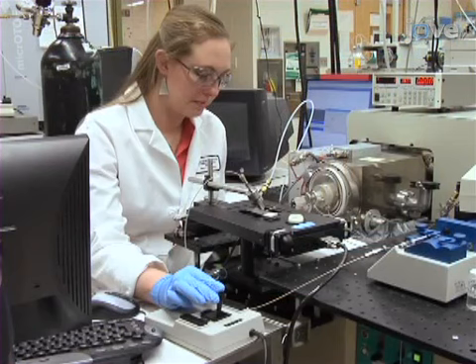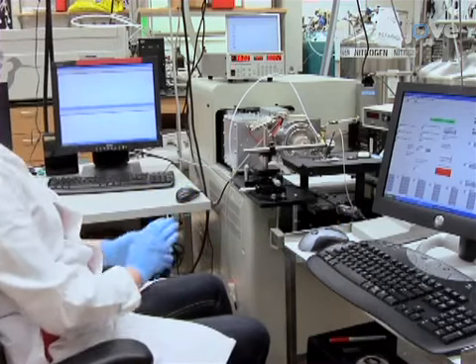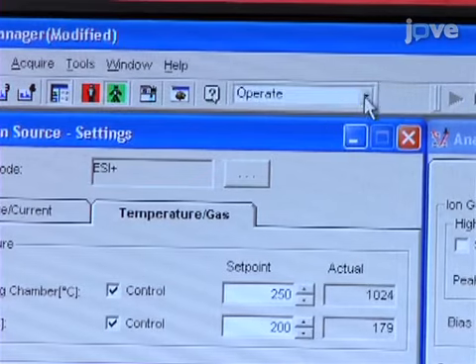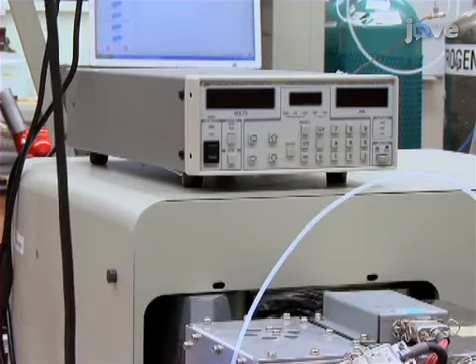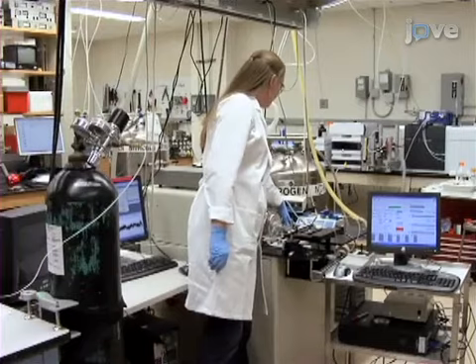Next, position the spray impact spot in the top left of the area to be imaged. Begin the acquisition of the MS data and the stage motion simultaneously. Upon conclusion of the data acquisition, return the mass spectrometer to standby mode. Turn off the high voltage of the DESI source. Turn off the nitrogen gas and the syringe pump.